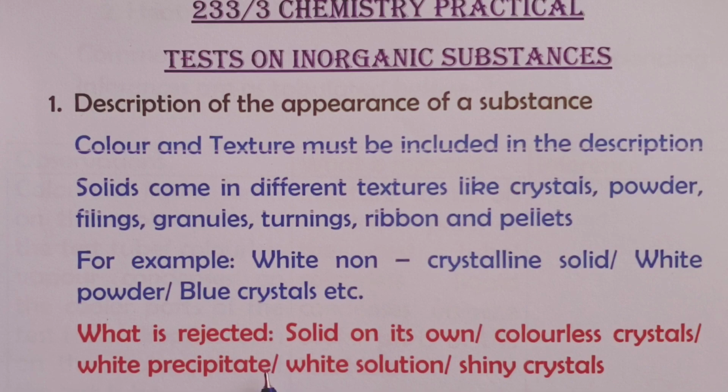Now, if a candidate talks about just a substance being a solid on its own, this is usually rejected. We also have on the list of rejected descriptions, colorless crystals, white precipitate, white solution. These are some of the descriptions that our candidates give to the solids provided. So all these will not be accepted. On the list, we also have shiny crystals. We shall not accept that as well.